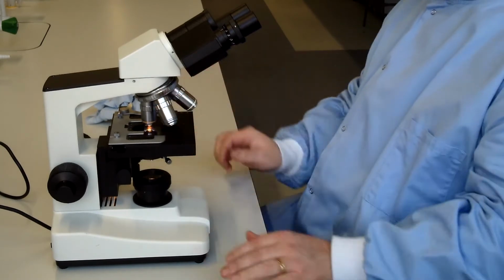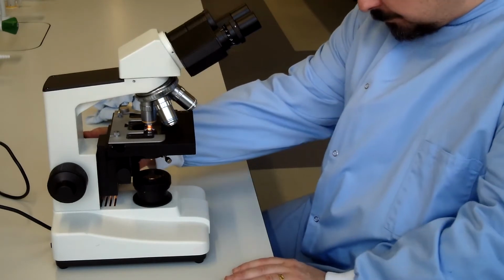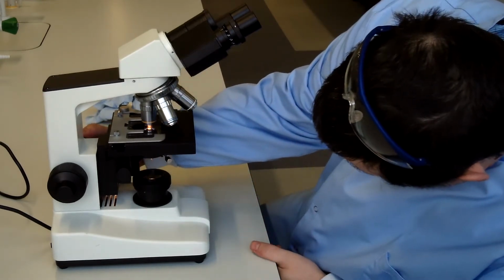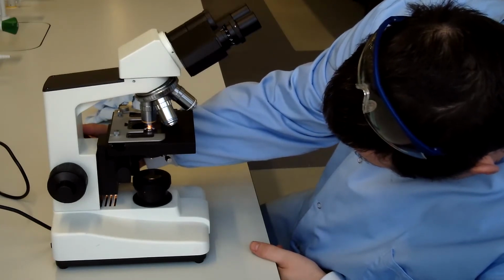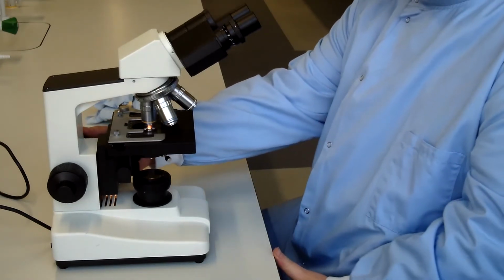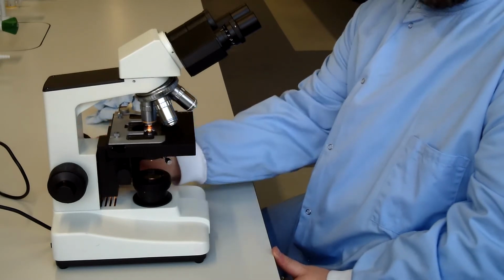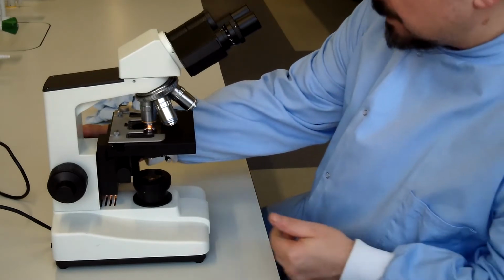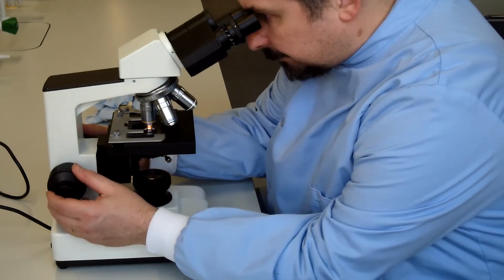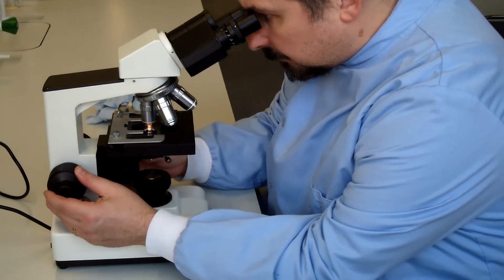At this magnification, to make sure that we don't damage our slide or the objective, we need to bring our eye level down to the level of the stage. This enables us to bring the stage upwards towards the lens, but to make sure that it doesn't contact the lens or break our slide. When we've done this, we can look down the eyepiece and then focus away from the objective, and this makes sure that neither the equipment nor our slide is damaged.